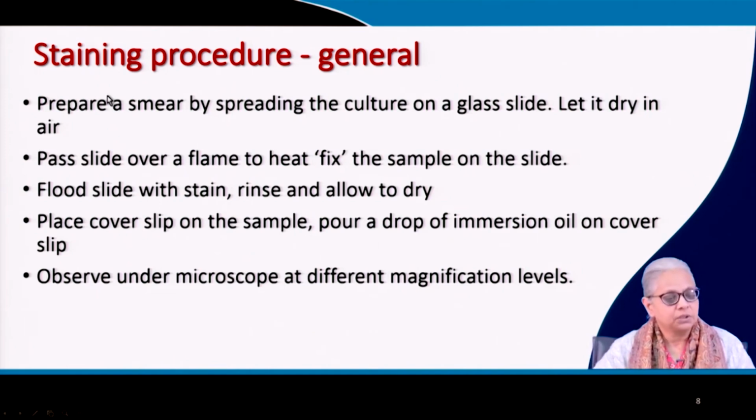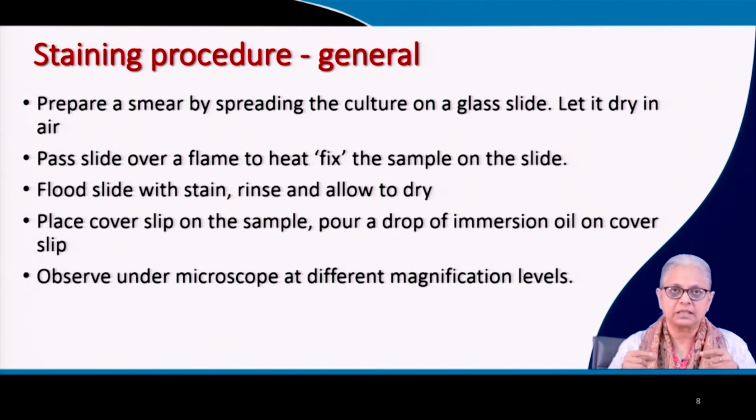All right, so let's take a look at the staining procedure. You can refer to the graphics in the textbook. They are very simple and easy. But what is done is you take your microscopic glass slide, you take your sample, spread it on the glass slide and let it air dry. Let some of the moisture be evaporated.